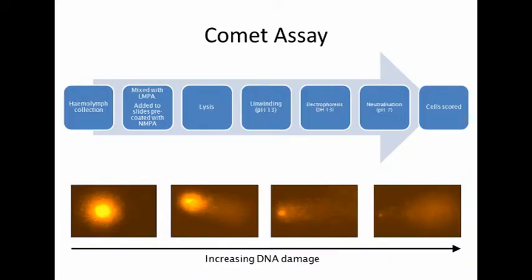Okay, I'm not going to go into this in too much detail, but I just wanted to mention a couple of the tests we use in case their names come up so they'd be familiar to you. This is actually a very simple process, though it doesn't look like it. It's also a very cheap process that just requires a few chemicals. So this test can be used in the field, on field-based samples, and in the lab as well. And it's essentially a measure of DNA damage.